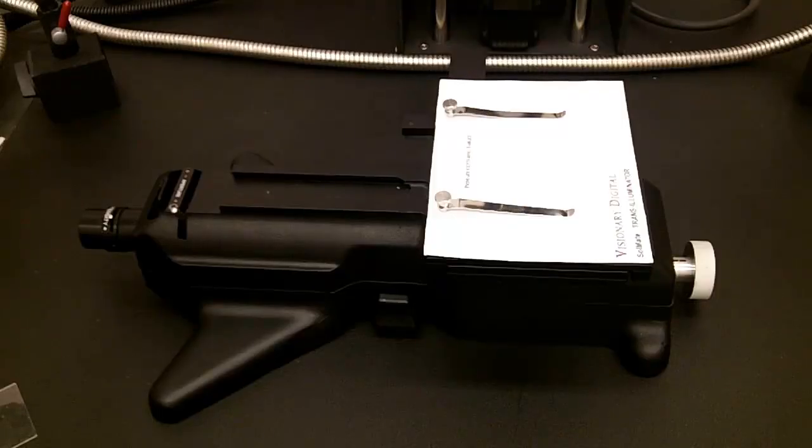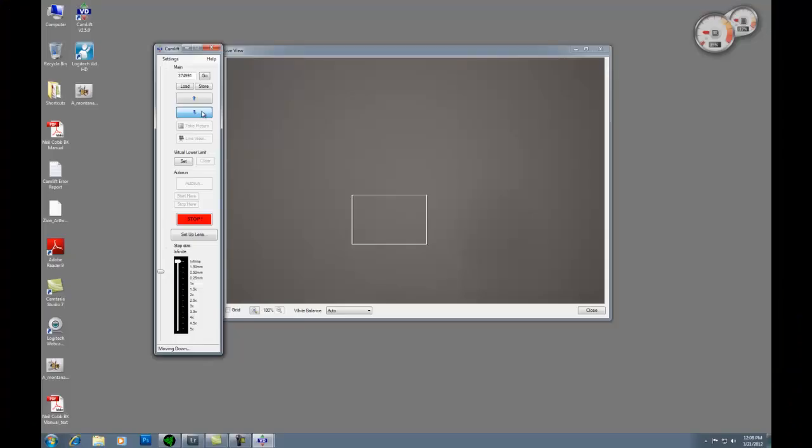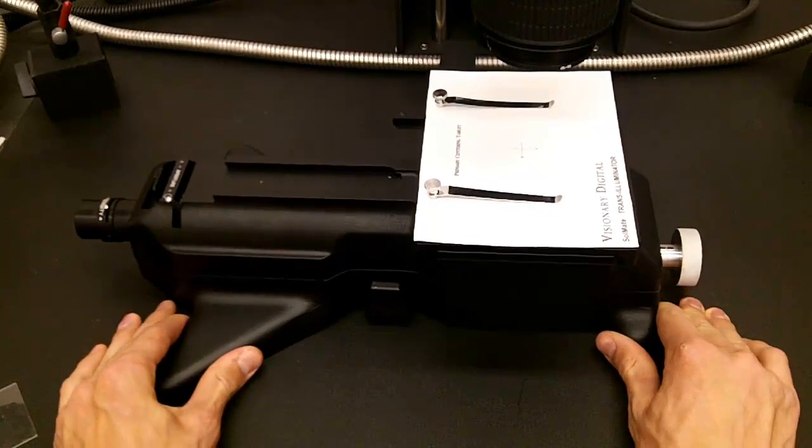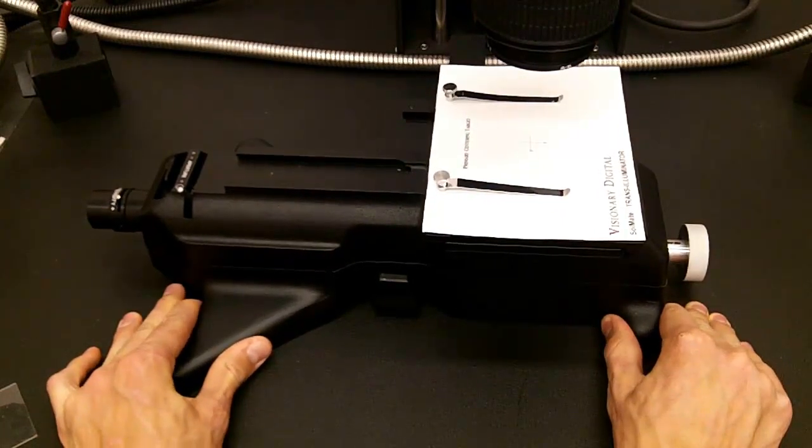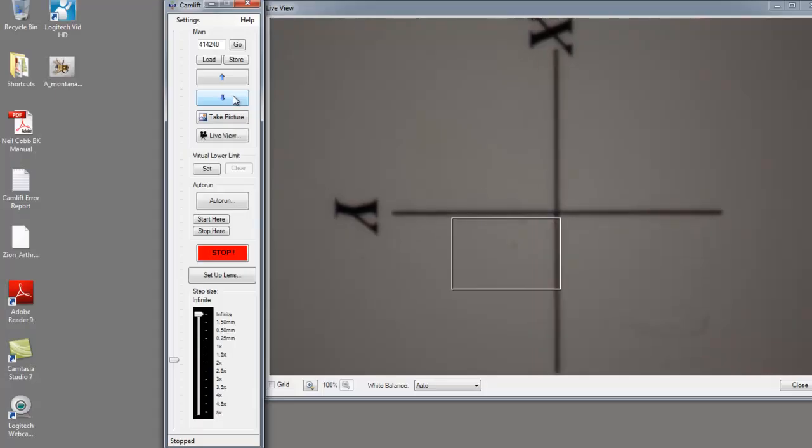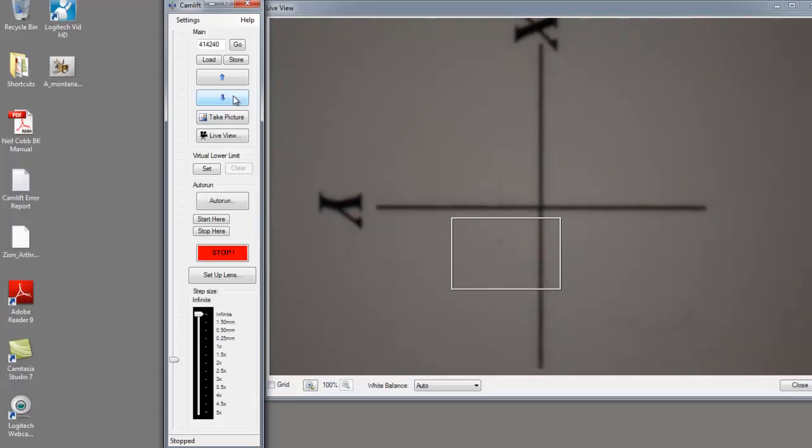Once you have the camera set up, the first step is to center the soulmate. First bring down the camera until the crosshairs on the targeting sheet are in view. Then physically move the soulmate so that the crosshairs on the targeting screen are centered in your field of view. This will make sure that the soulmate is centered and that your specimen is right over the lighting where it needs to be.